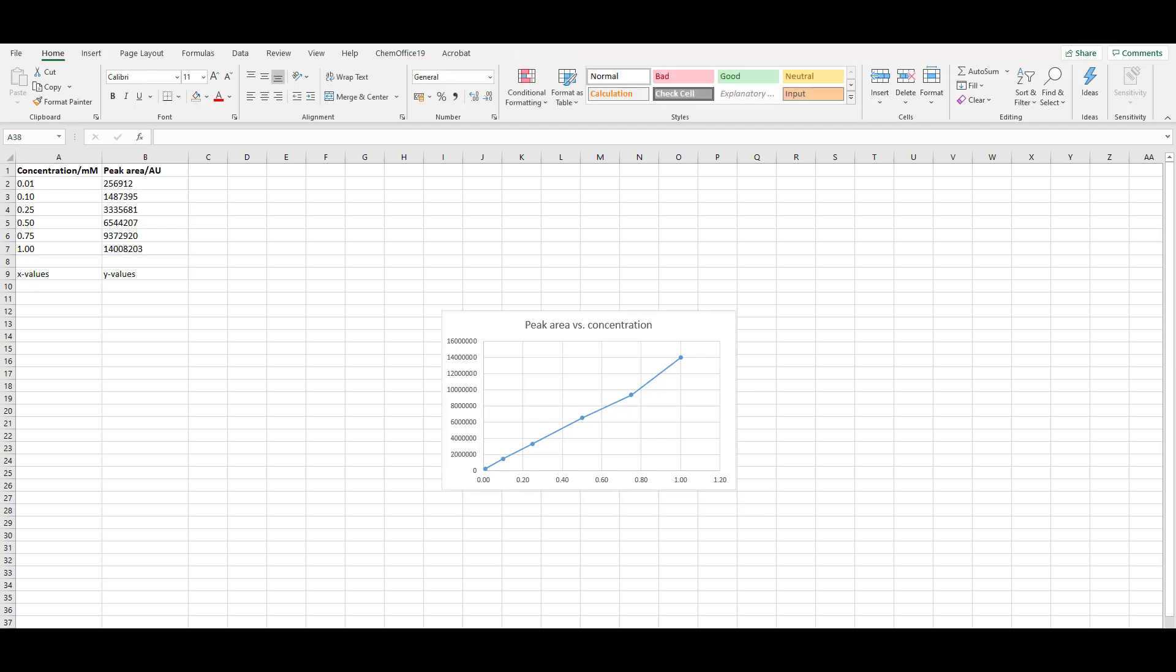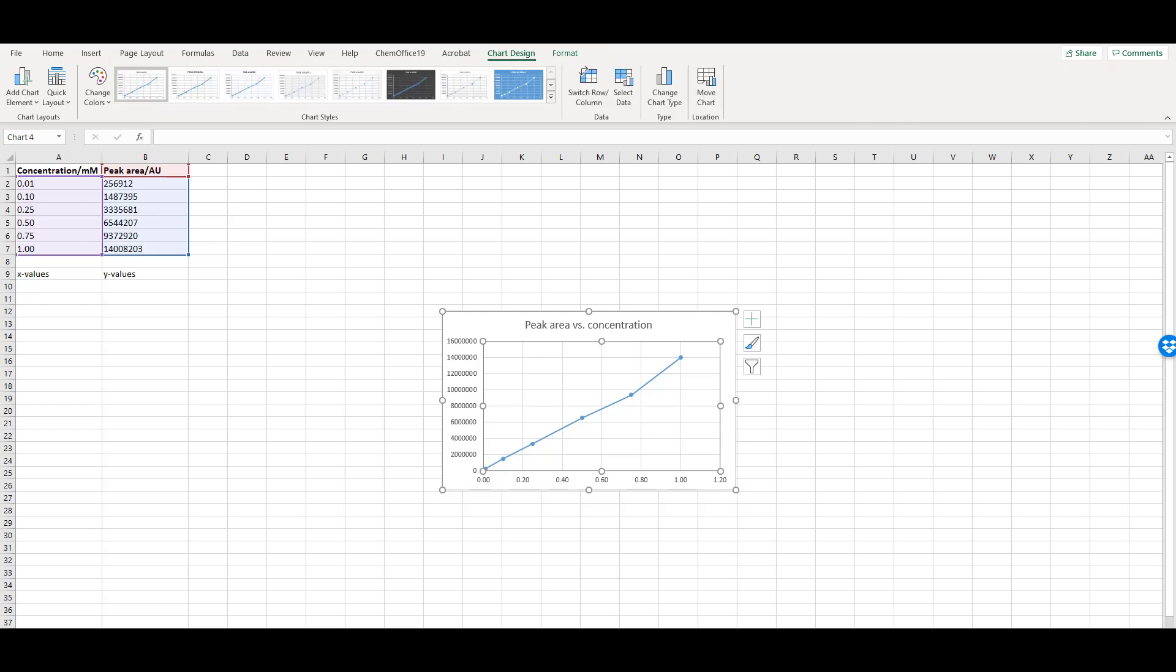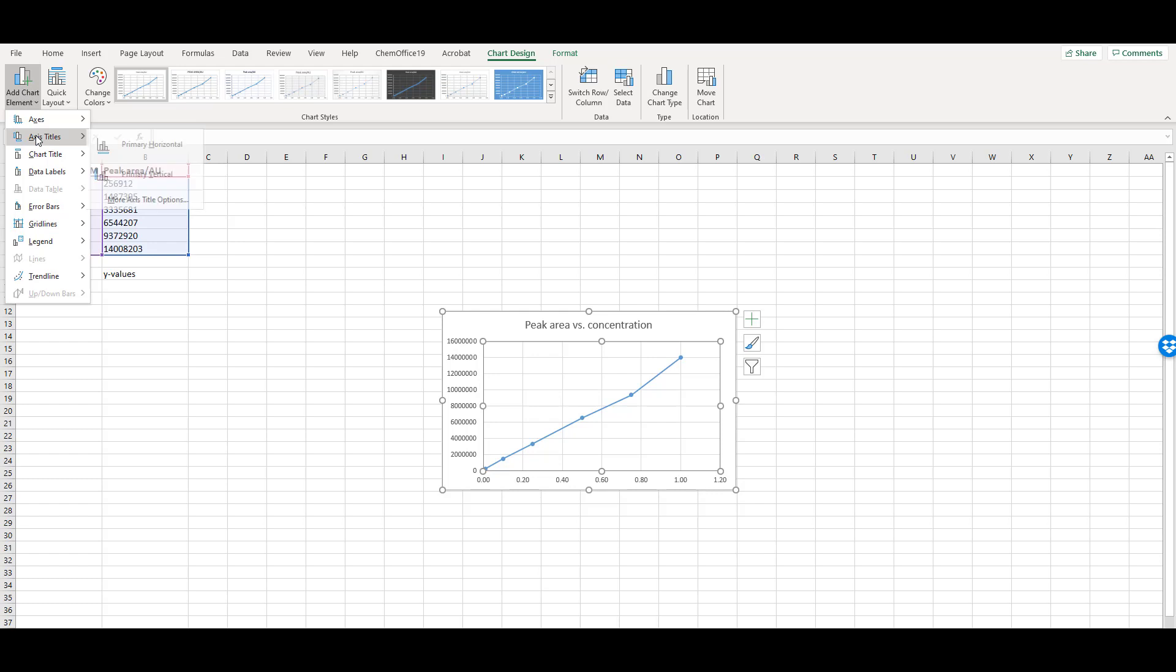The axes should also be labelled including any units. If you click on the graph, two more tabs appear, Chart Design and Format. Select the Chart Design tab and go to Add Chart Element, Axis Titles. You'll need to add both primary horizontal and primary vertical axis titles. These correspond to the x- and y-axes respectively.